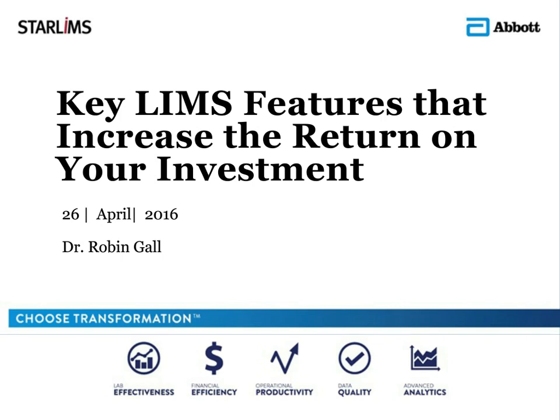Thank you, Trevor. Today I'm going to be talking about LIMS, Laboratory Information Management Systems. And as my co-presenters have shown us this morning, a laboratory generates a lot of information and a lot of data. Laboratories need a mechanism, an automated, electronic system to manage all of this data that's being generated. Now, there are a lot of these products out there on the market, so today what we'd like to discuss is what key features we can look for to increase the return on our investment.